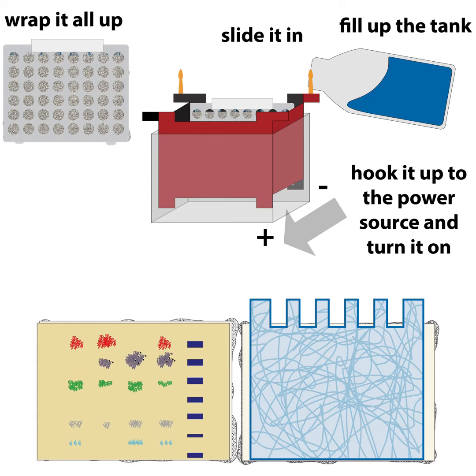Normally when we're running a normal SDS-PAGE, we'll use a cheaper ladder, which isn't pre-stained, and you stain it the same as you do your proteins, and you're just relying on the loading buffer to track the run. But here it's important that you see that the proteins actually get transferred. If you use a pre-stained ladder, then that ladder is going to get transferred from the gel to the membrane along with all the other proteins. So the pre-stained ladder should all be on the membrane and not on your gel.